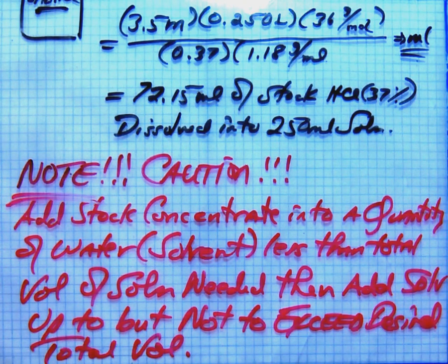72.15. And you know, if you don't have a pipette that'll pipette 72.15 milliliters, get you a dry reservoir or sample, big test tube or something, and transfer it in portions until you get your 72.15 milliliters of acid. And then you slowly, with stirring, stir bar on your stir plate, slowly add that acid into that water. Once it's dissolved, then you can continue to bring it up to what is specified in the instructions without killing yourself. If you try to pour water onto 72.15 milliliters of 37% HCl, it'll blow up your face.